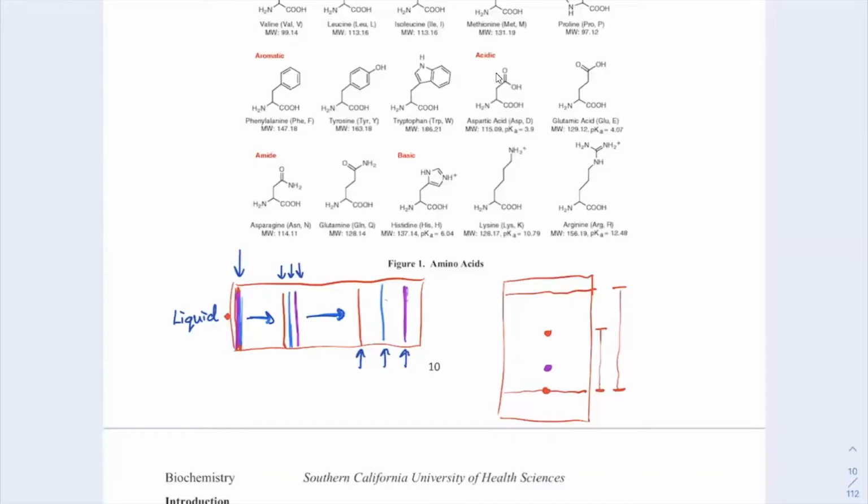This is shown going from left to right, but in reality, the practice of what we're doing in this experiment in TLC starts from the bottom, that is from the bottom of a beaker or a TLC chamber, and moves vertically up through the paper. So this paper is wicking up the eluent or the mobile phase. That is this part. Across the paper, which is the stationary phase, and that is pulling these spots and separating them.